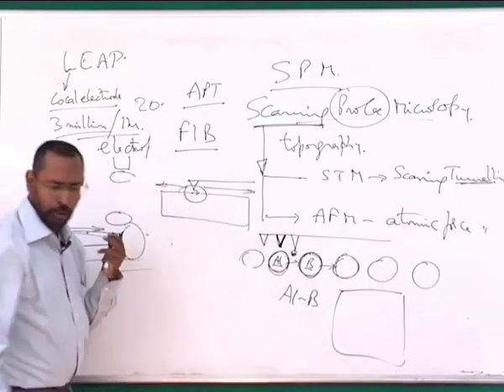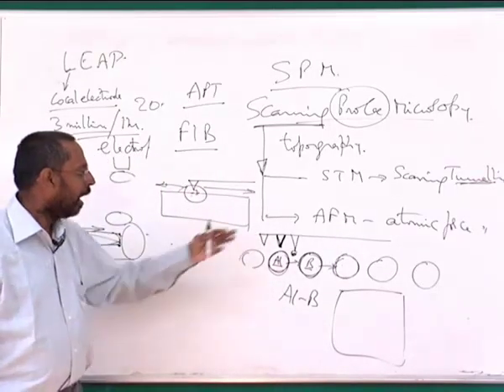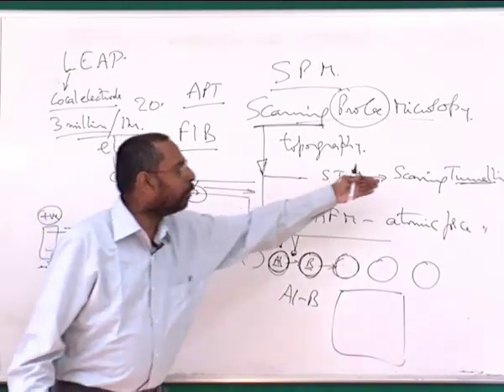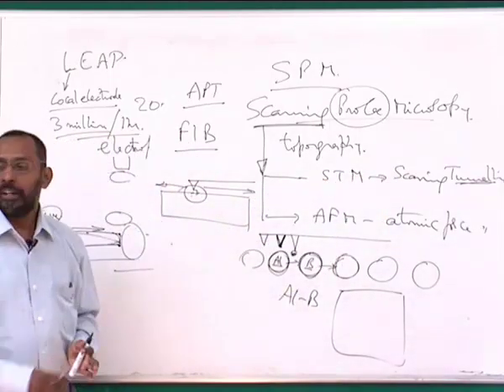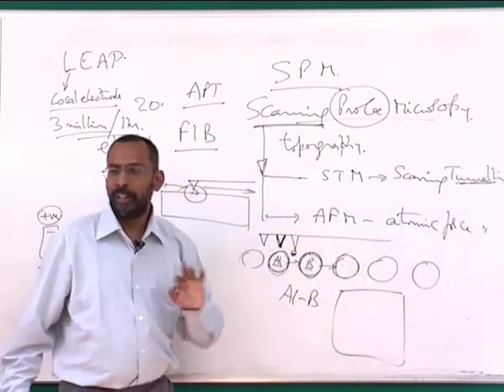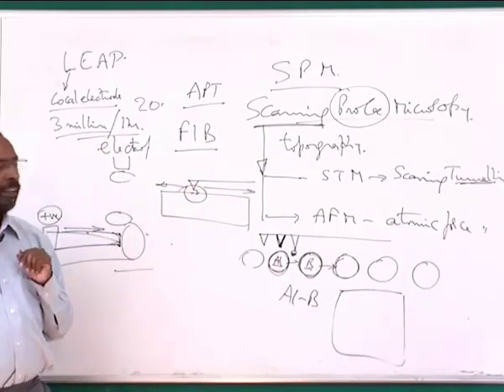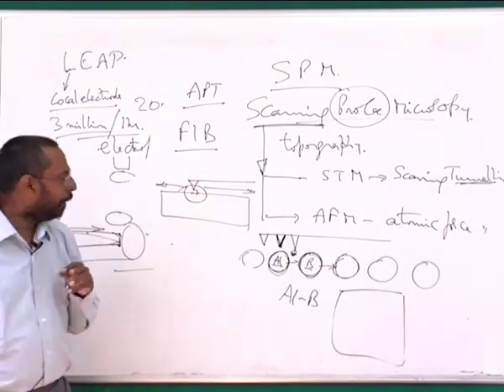So once you prepare such a sample, and once you prepare such a probe, you use that probe and are able to get information. Not only can you get information on the surface at the atomic level, interestingly, if you see carefully, so far we have said the resolution depends on lambda.